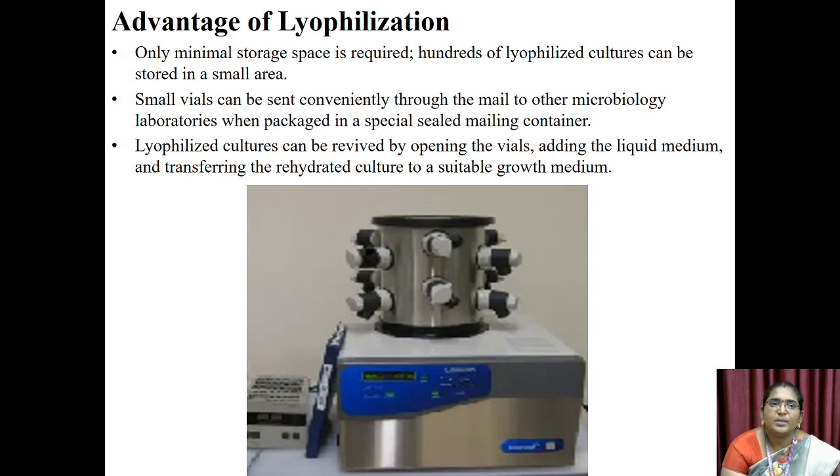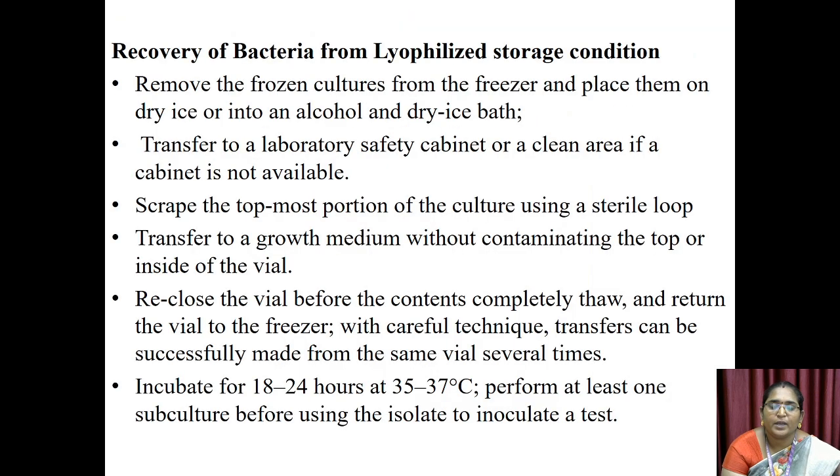Small vials can be sent conveniently through the mail to other microbiology laboratories when packed in a special sealed mailing container. Lyophilized cultures can be revived by opening the vials, adding the liquid medium and transferring the rehydrated culture to a suitable growth medium. Recovery of bacteria from lyophilized storage condition.